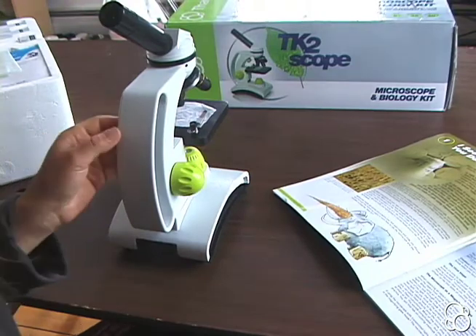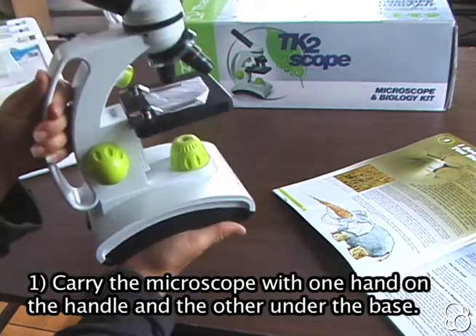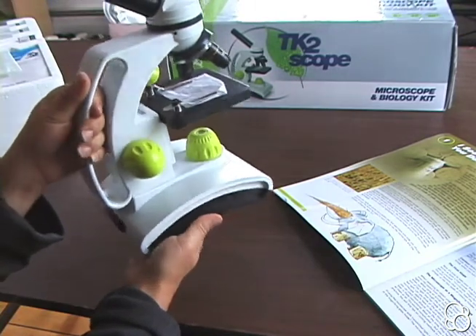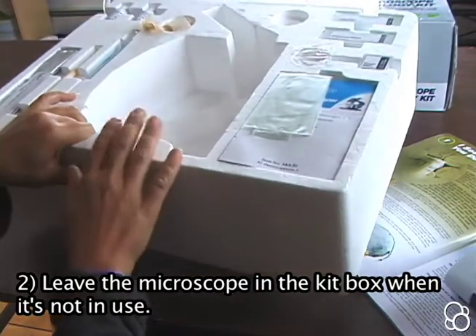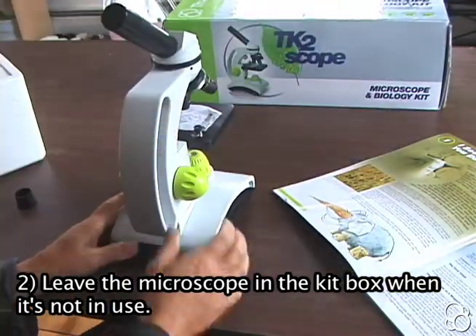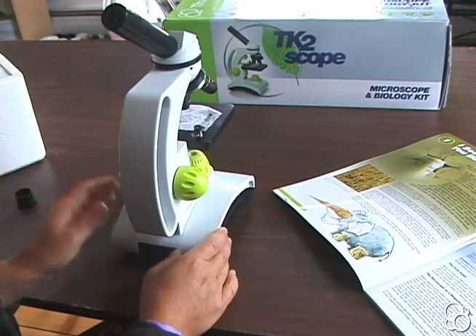First, you always want to carry the microscope with one hand on the handle and another hand under the base. And when you're not using it, you should always leave it in the styrofoam kit box so that it stays clean and doesn't gather dust and you can use it for a long time.